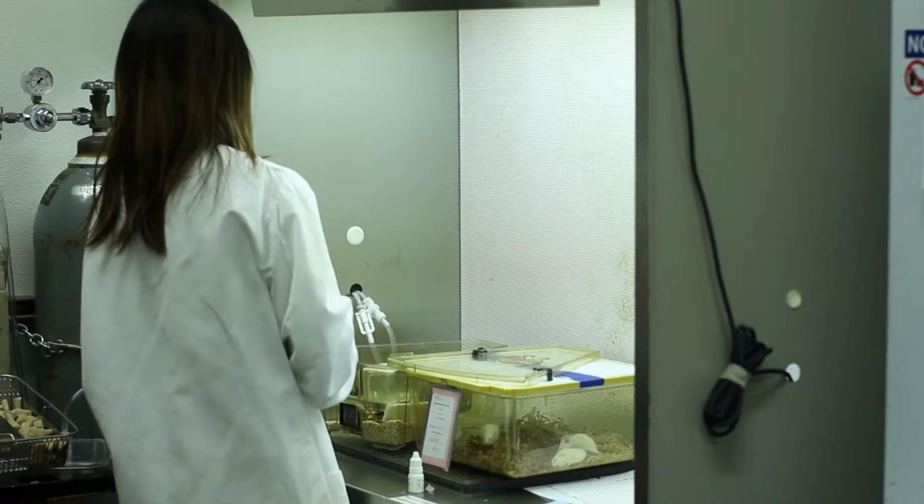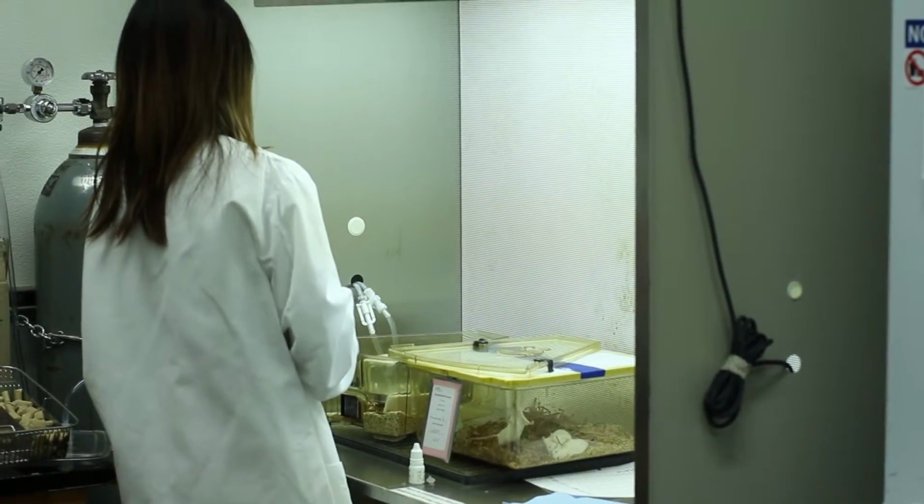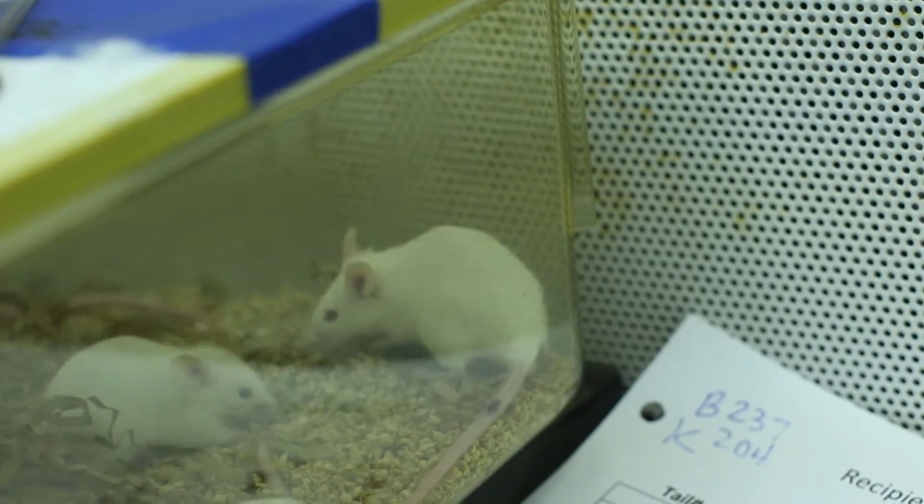An excellent example of how fresh cancer tissue is used for research involves our collaboration with the Jackson Laboratories. They are implanting the tissue, again within hours, into a mouse model who can grow the tumor and then serve as a model for that cancer.